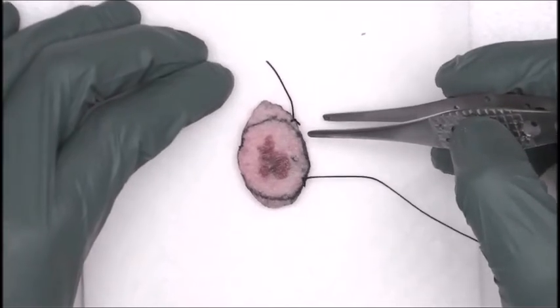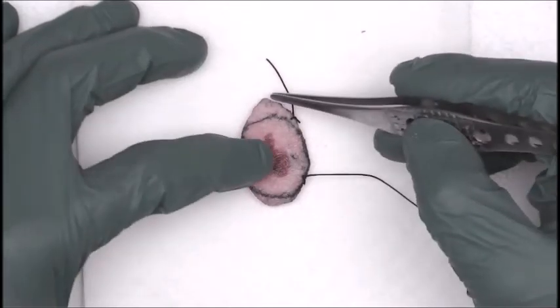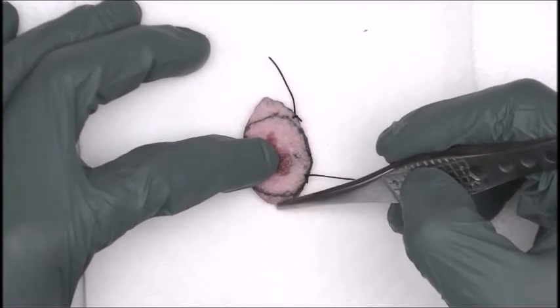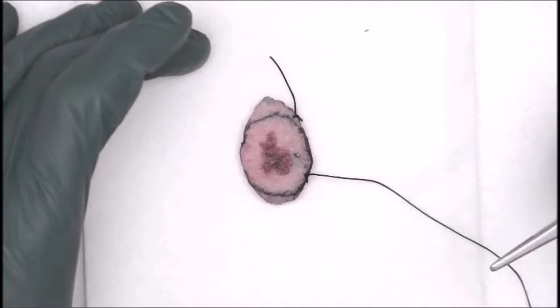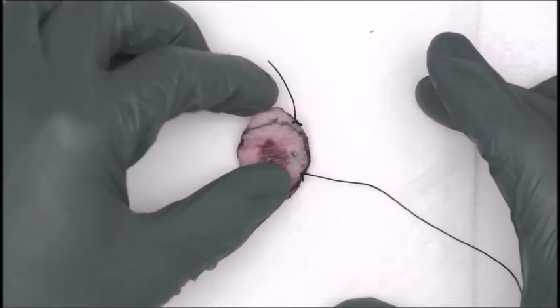So what I'm going to do for this case is just ink the 12 to 6 o'clock side green, the 6 to 12 o'clock side blue. And that's going to be just 2 colors. So the way we do this is flip the ellipse over like this.